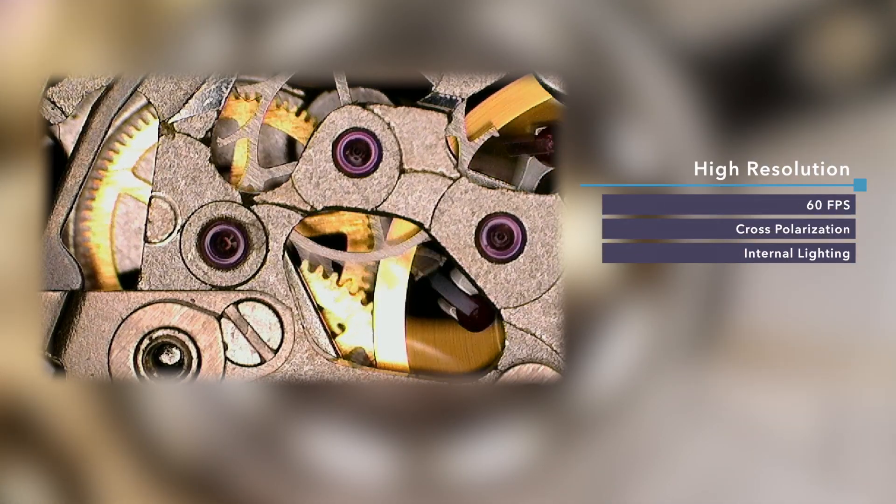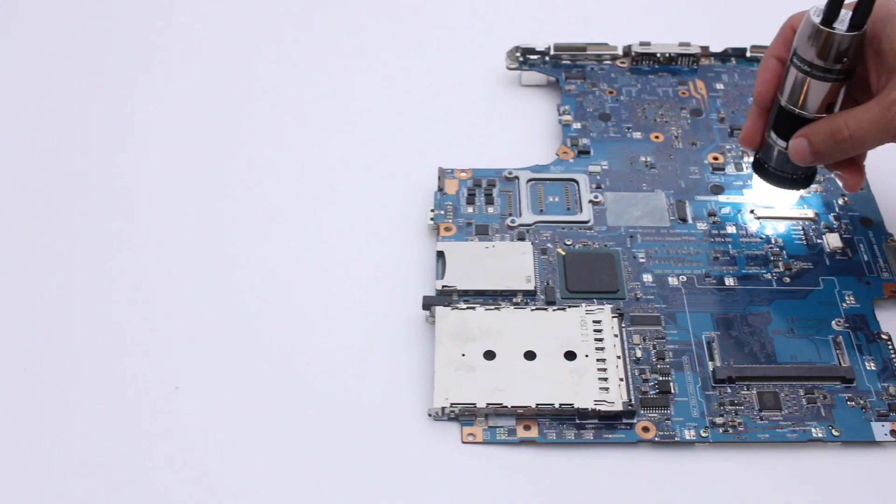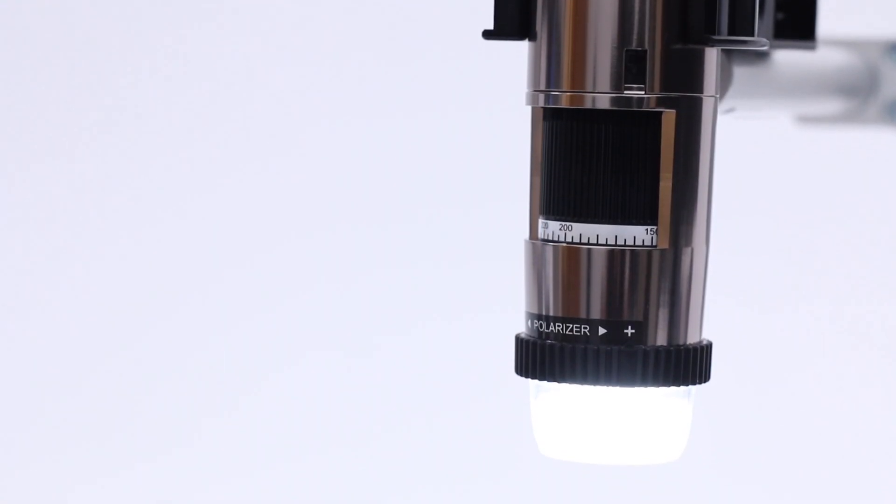The high resolution and frame rate produce a clear image that is perfect for handheld inspection, assembly, interactive displays, and more.